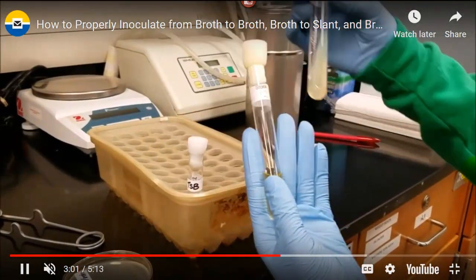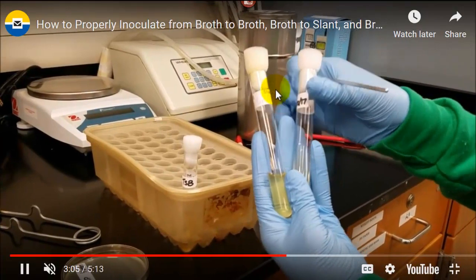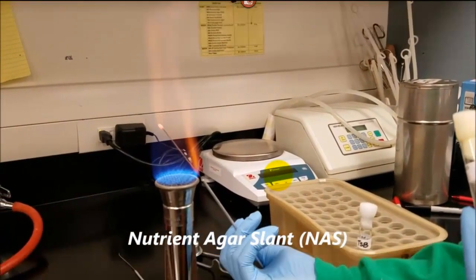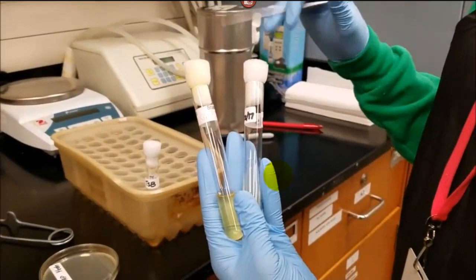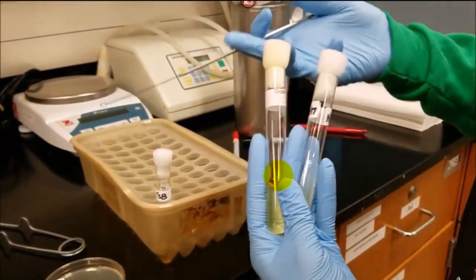All right, next, here we have an agar slant. You see it's sterile here. There's nothing growing in it. Here is a broth culture. She's going to sterilize her loop, and she does it very efficiently. Has a nice big Bunsen burner there. So if she did what she did before, she's then going to take the lids off of the tubes.